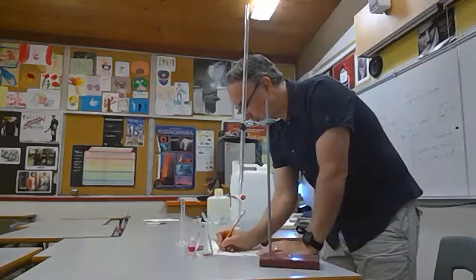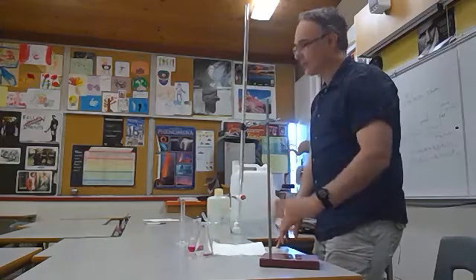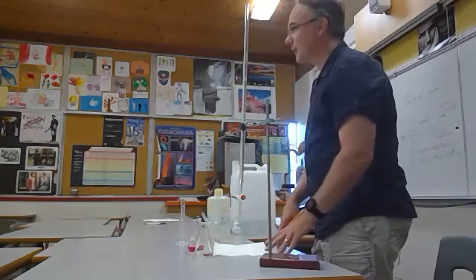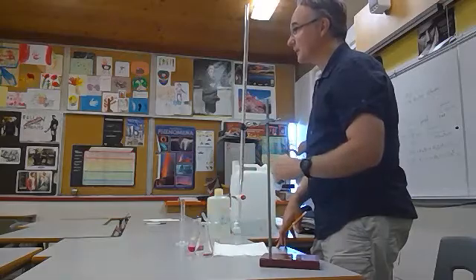And so what we're going to do is figure out what the molarity is. Just doing one trial, it's kind of gone now, right? So I'm probably close to there. We're going to do one trial, and then see how we do the calculation on it. Okay. So I'm just going to turn this to face forward.